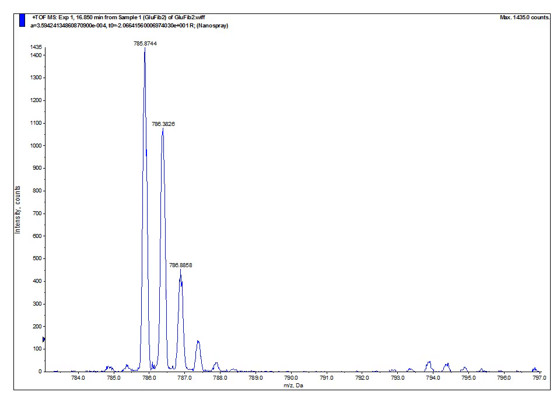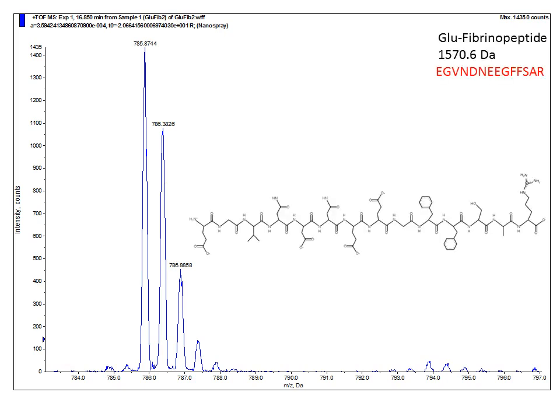In the scan for intact peptide ions, a mass range of 350 to 1500 Daltons is typically scanned, but this spectra for glu-fib has been zoomed in. Using electrospray, multiply charged ions are created, and peptides having multiple amines that can be protonated are at least doubly charged. As the mass spectrometer measures mass divided by charge ratios, the difference in mass between the C12 and the C13 isotope is half a Dalton for a doubly charged ion. This is used to select ions for fragmentation rather than have the instrument waste time fragmenting non-peptide ions.